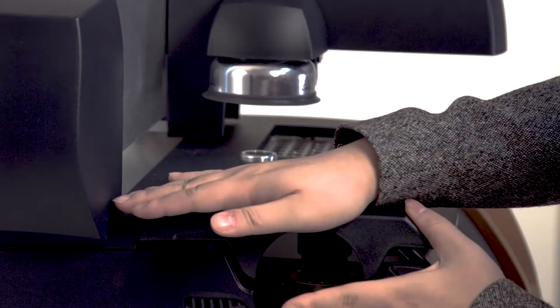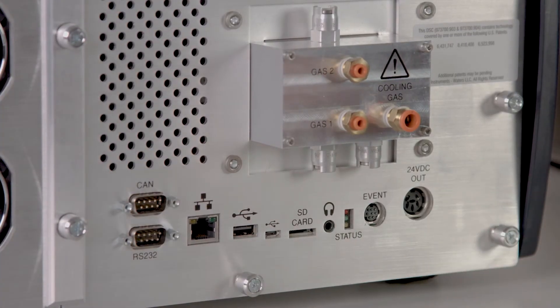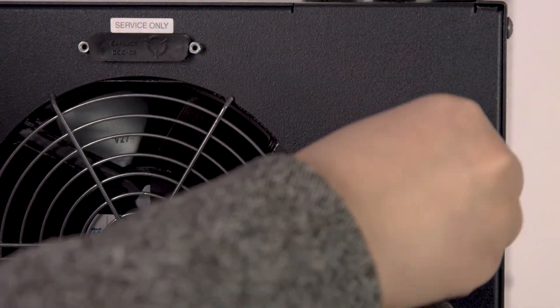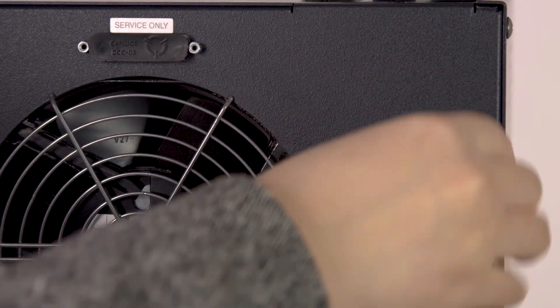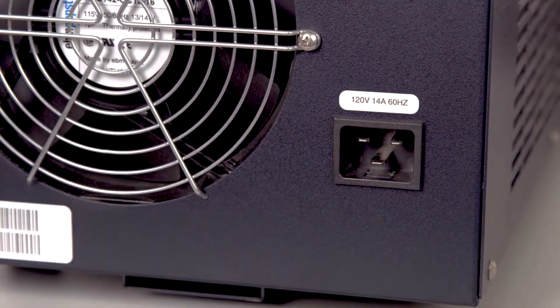Replace the top cover on the DSC. Disconnect the event cable. Disconnect the main cable.